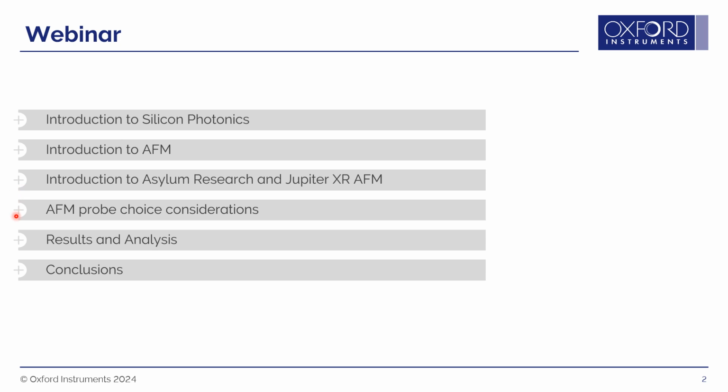And then before handing things off to Marta, I'll introduce some important factors that need to be considered when choosing an AFM probe. At that point, Marta will take over, and she'll present her work demonstrating various types of AFM measurements on silicon photonic devices and the analysis capabilities available for their interpretation. Finally, we'll wrap things up and have a question and answer session.